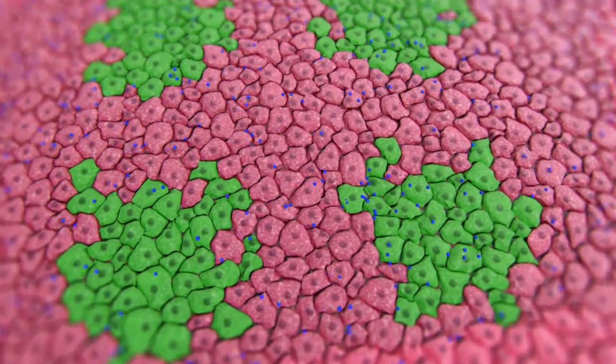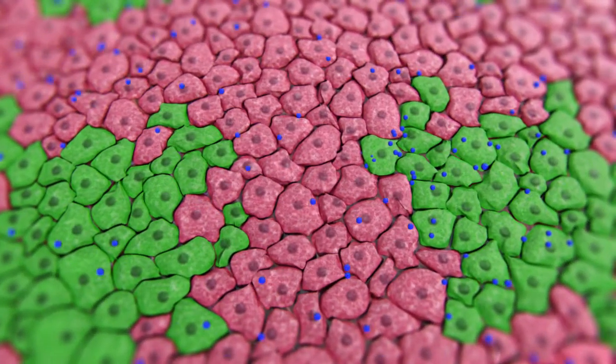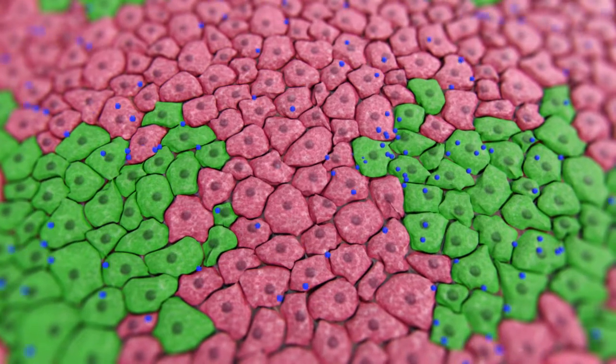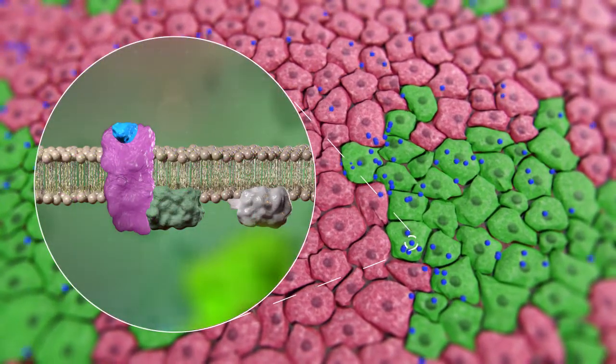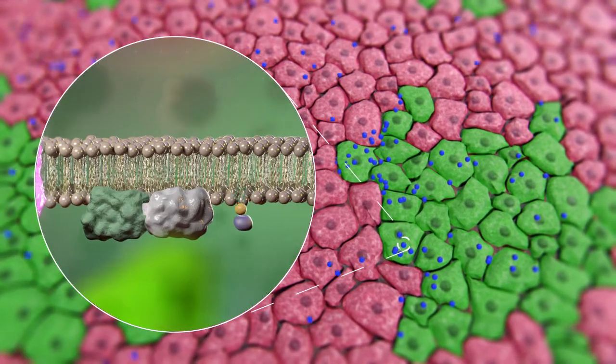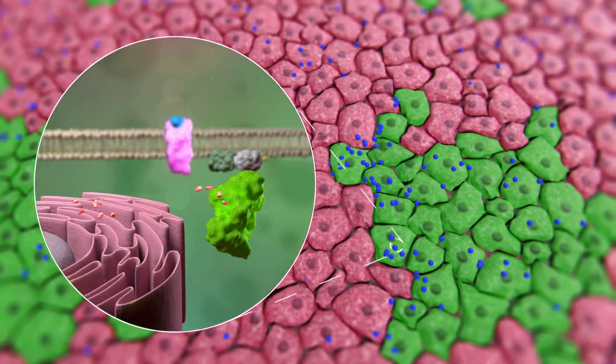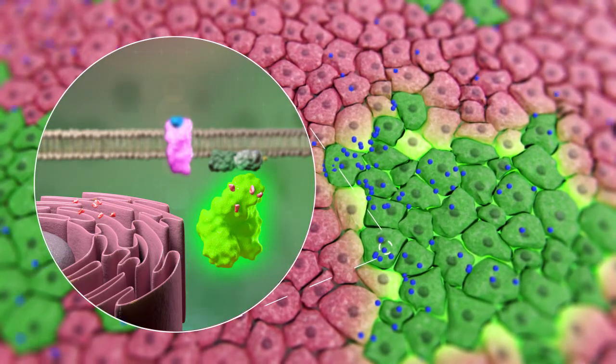The receptors expressed by the cells are sensitive to specific molecules in the sample. When these molecules interact with the receptors, they trigger a transient calcium buildup in the cell that in turn causes a temporary change of fluorescence from the calcium sensor protein.